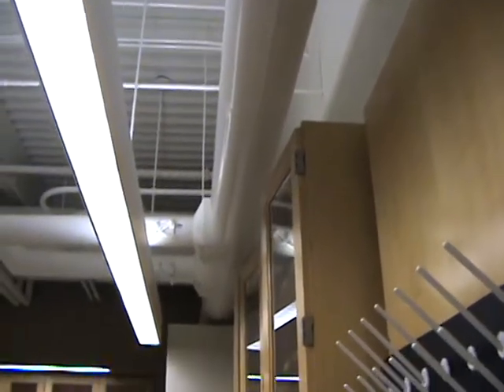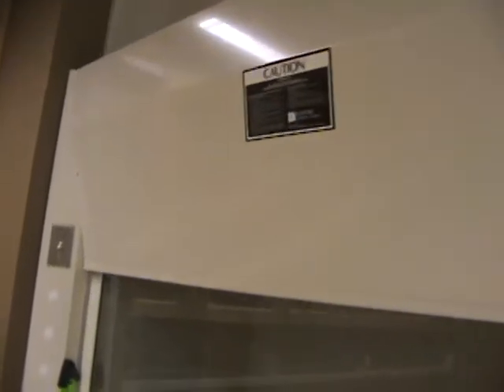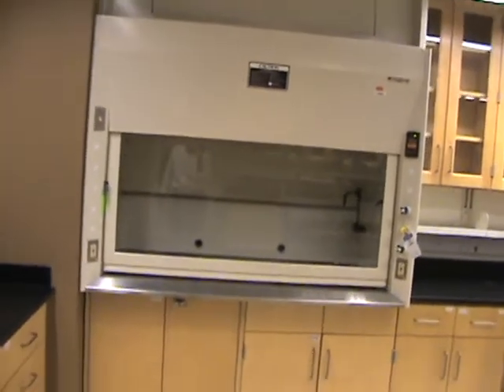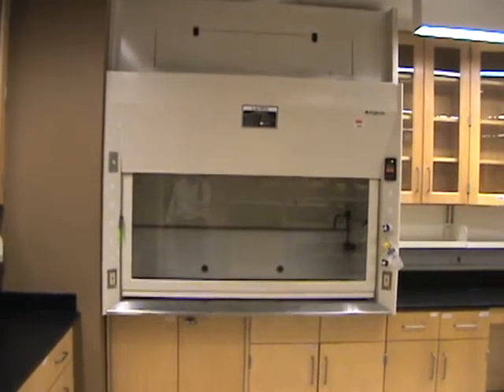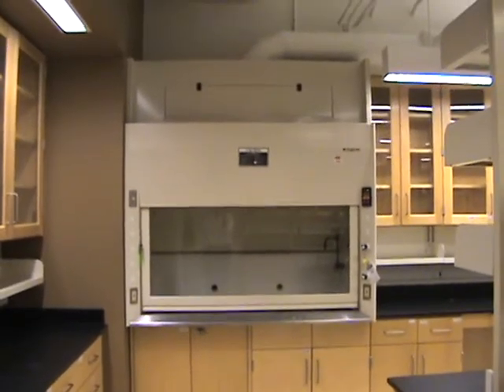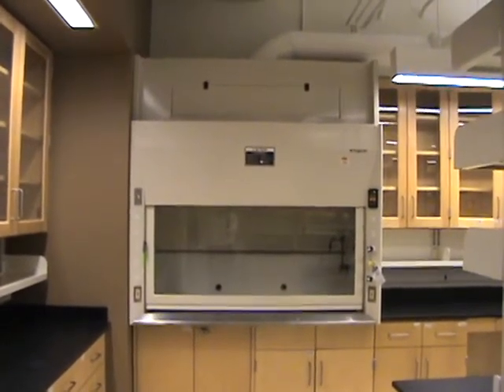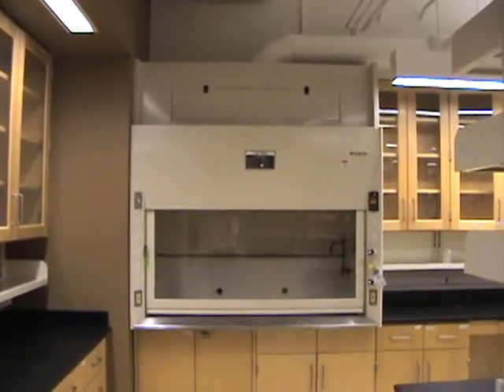In this particular incubator there are a total of 18 hoods in the building. These hoods can either be installed when the incubator is initially constructed, or more typically they are installed on the fly as labs are fitted out and companies move in one by one. You may be in the process of fitting out labs and installing these hoods over several years.